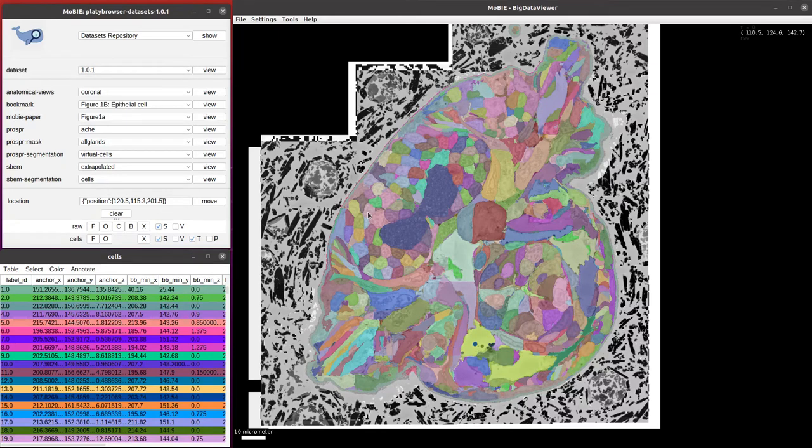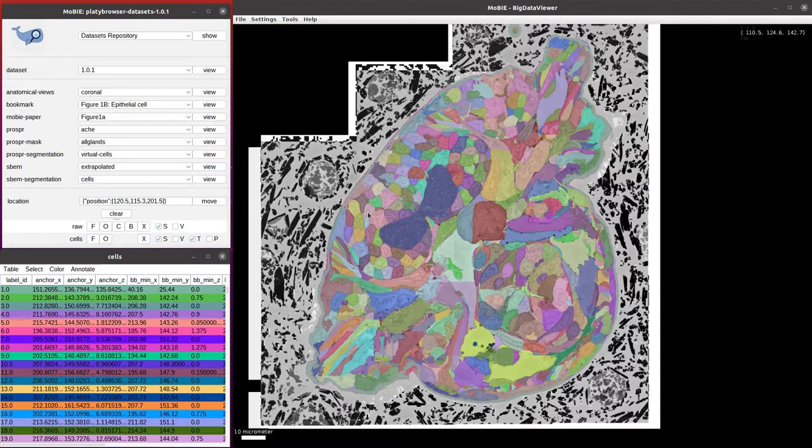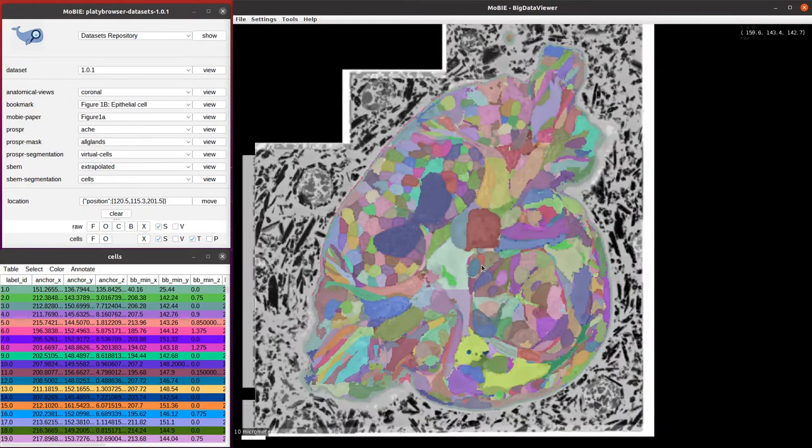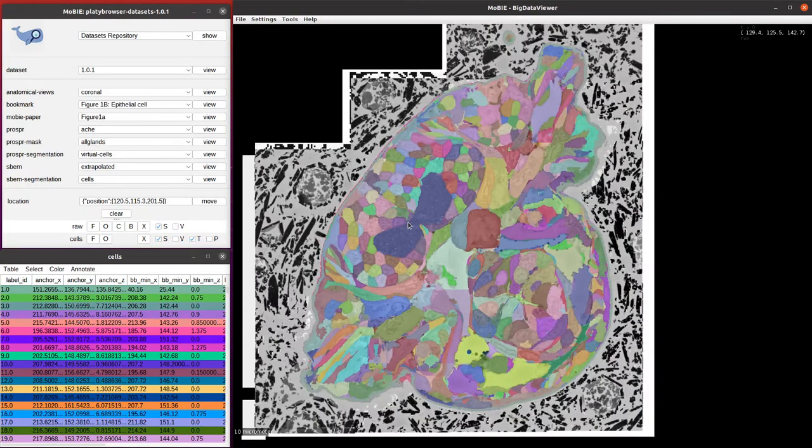Here we have an open MoBIE project with datasets from a marine worm called Platynereis dumerilii. Here we show a 3D electron microscopy volume with a cell segmentation overlaid on top. Each color here is one individual segmented cell.